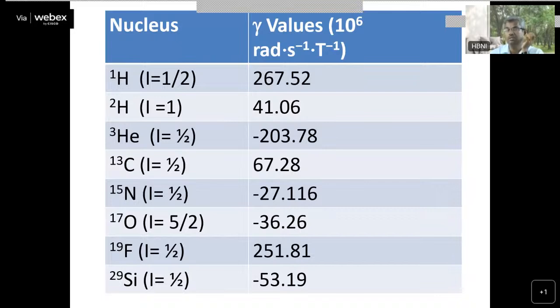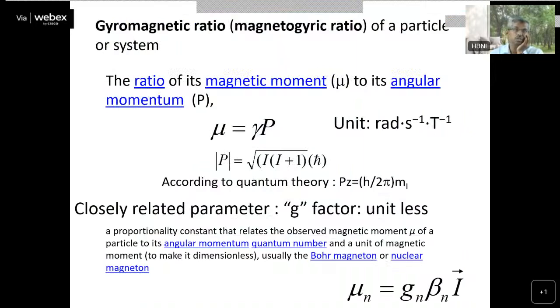If you record proton NMR spectra in solids, you see extremely broad line shapes which are difficult to interpret. But in solution, proton NMR gives almost everything. You can very easily get the information and arrive at the structure of the molecule. But in solids, it gives a very broad line shape, making it difficult to interpret.